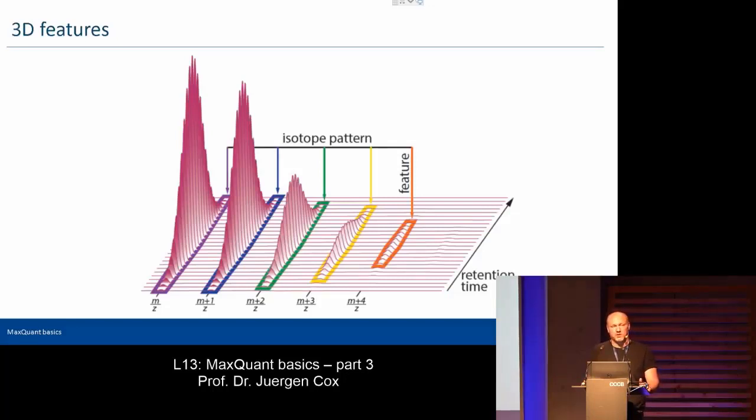So we do that, and also of course, since these are TOF instruments, you also have an intensity dependence of your mass error, and we also take that into account. Yeah. So that's all calibrated away, but the final answer that you get, the mass accuracy of the peptides, at the moment it's slightly lower, but one also has to say that these platforms are still under current development, and so I think that's not the final answer that we get for what the mass accuracy is. So I think that's anyway in the process of being strongly improved still. Okay.